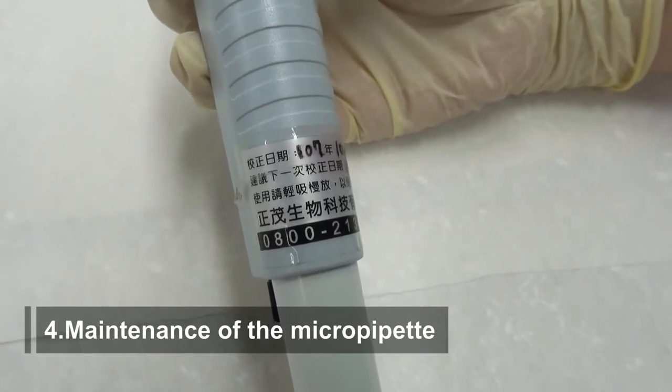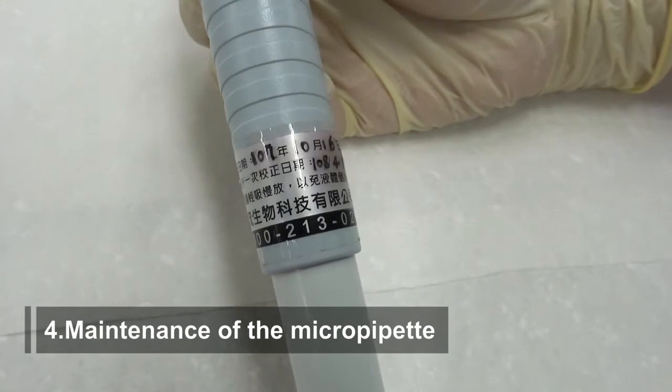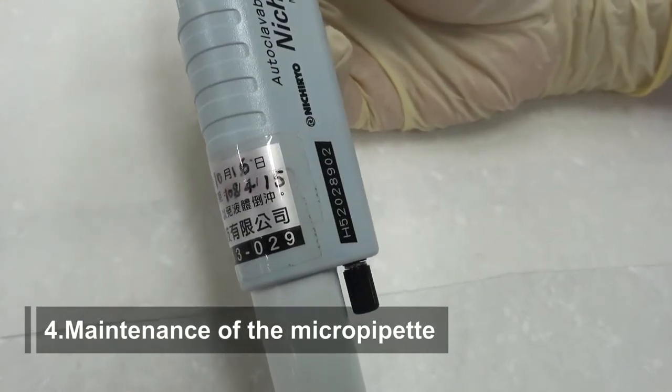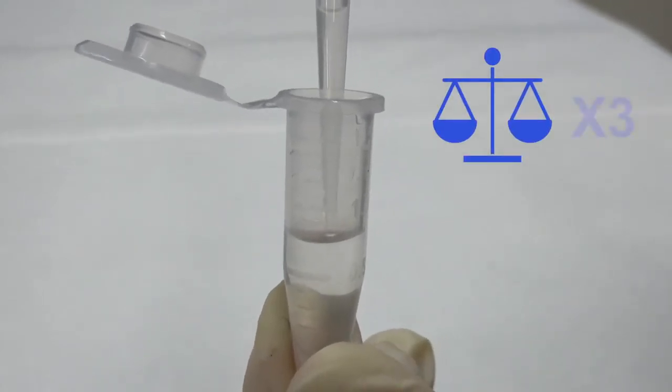Maintenance of the micropipet. The micropipet needs to be calibrated regularly to ensure accuracy and improve experiment reproducibility. A simple approach to check accuracy is to aspirate a certain volume of water and measure the weight. Repeat 3 times and calculate the error.